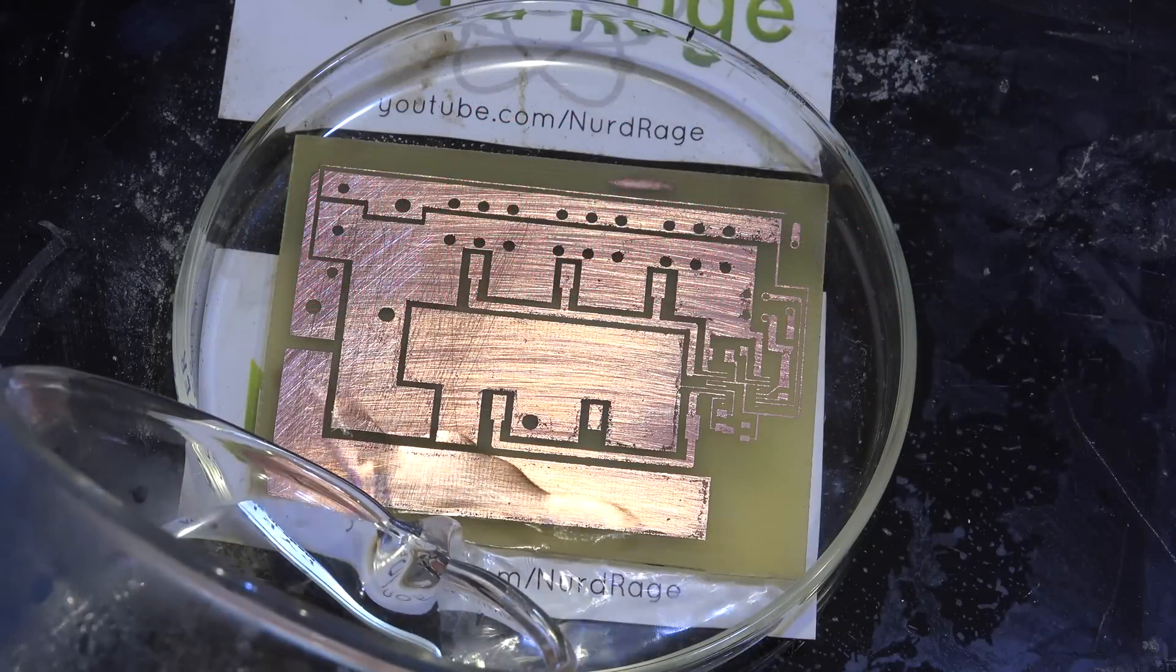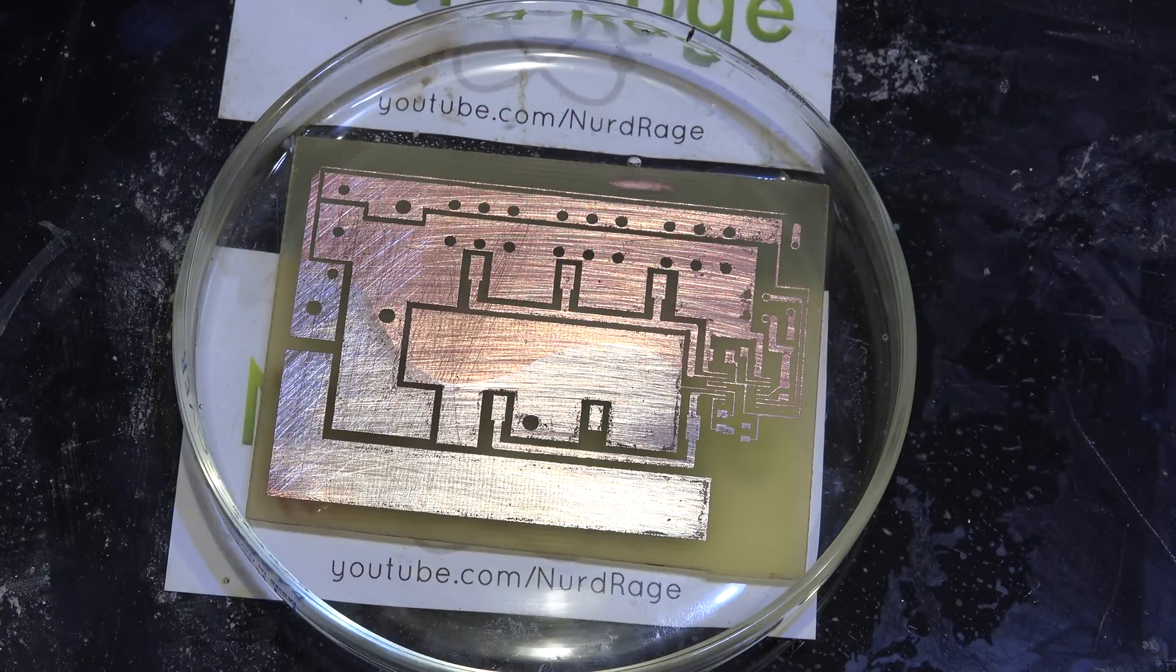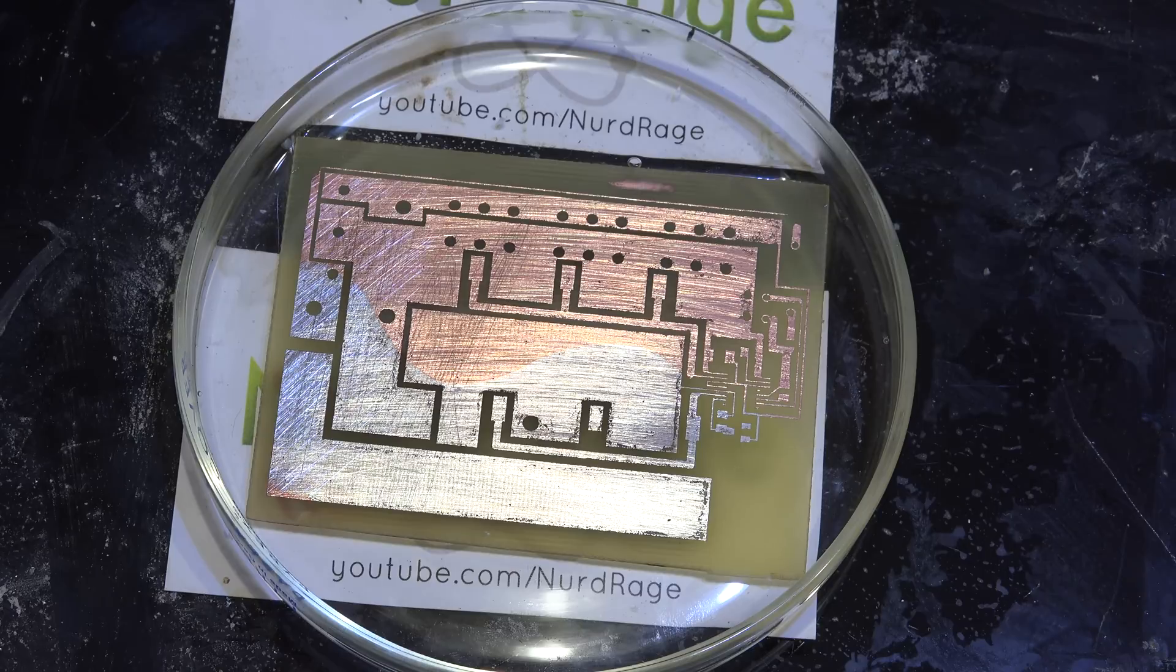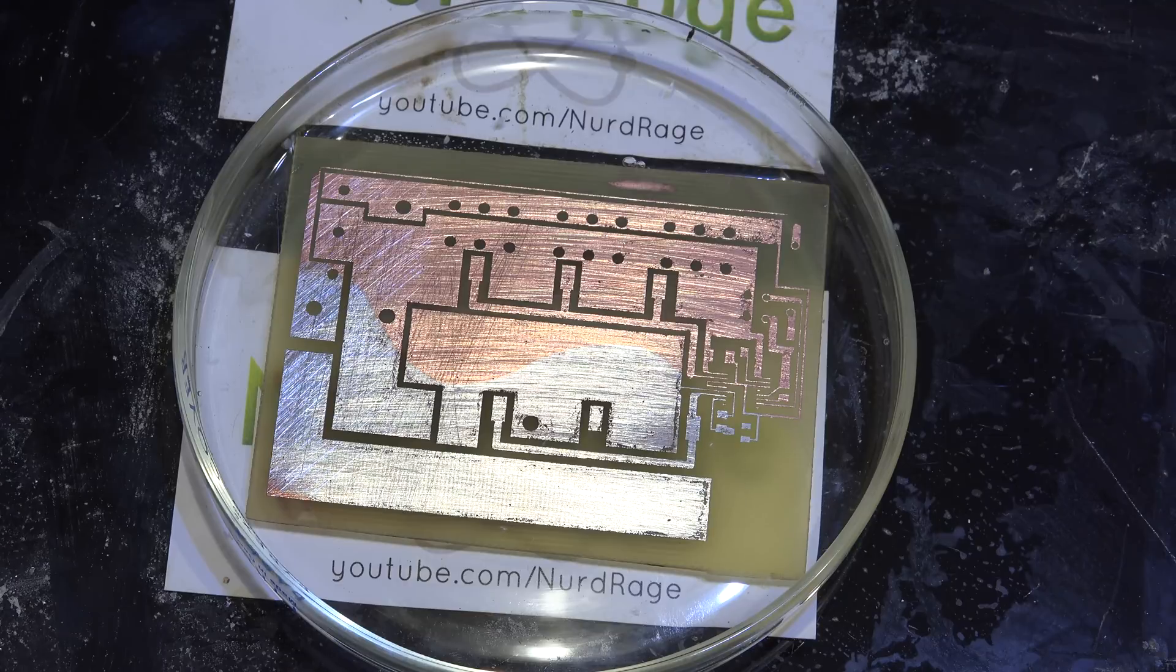Greetings fellow nerds. A number of electrical engineers have asked me to explore the chemistry of printed circuit board tinning solutions. When immersed in these solutions, copper metal will get a coating of tin metal.